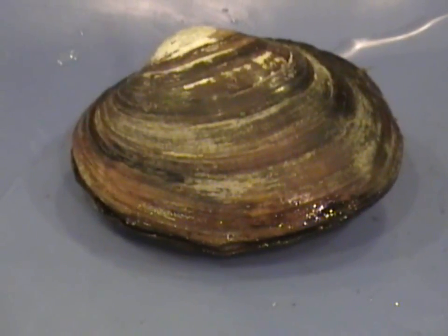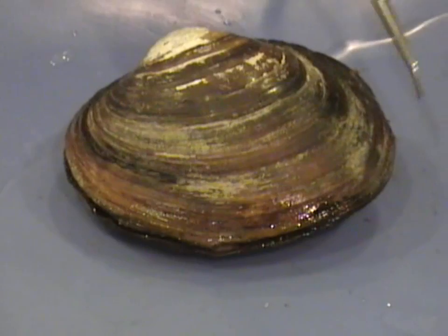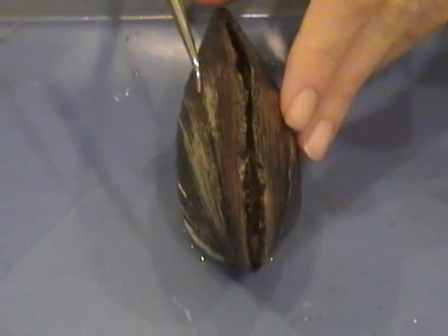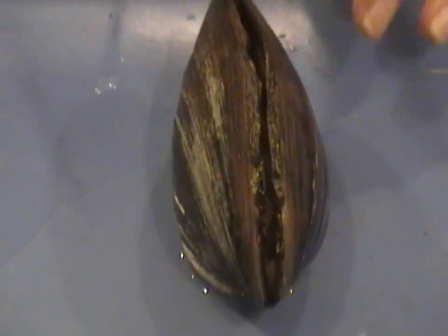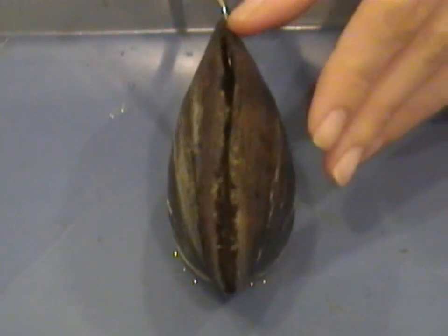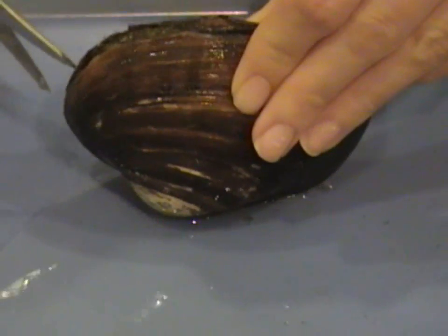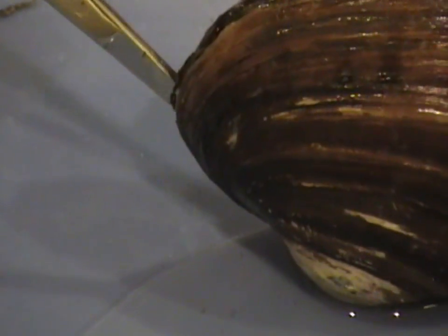It is now time to open up the bivalve. In order to do so, you need to cut through the anterior and posterior adductor muscles. Notice the right half of the valve — the right valve — and the left valve. Right there and directly across the other side are two circular-looking muscles. Using a scissor, gently cut through these muscles. Be careful not to cut through any other internal structures.